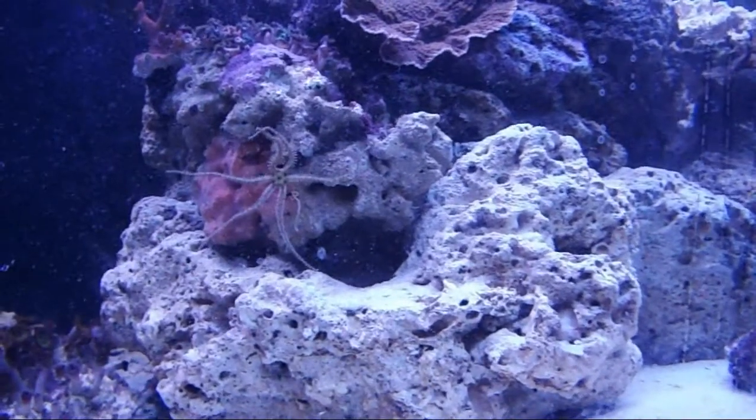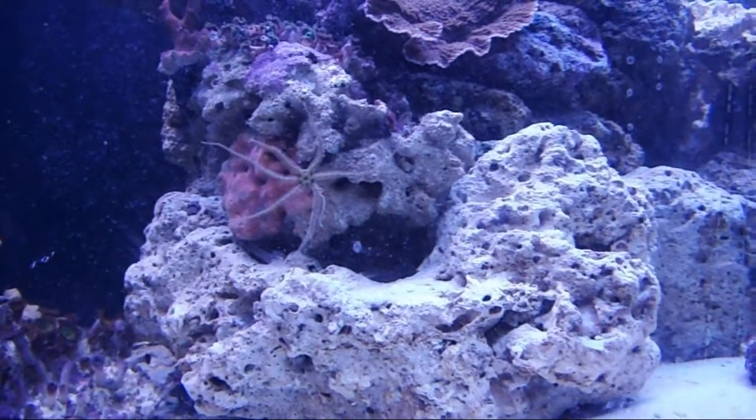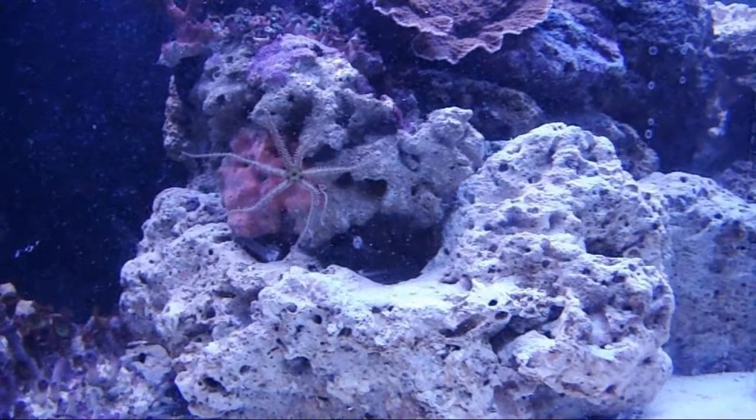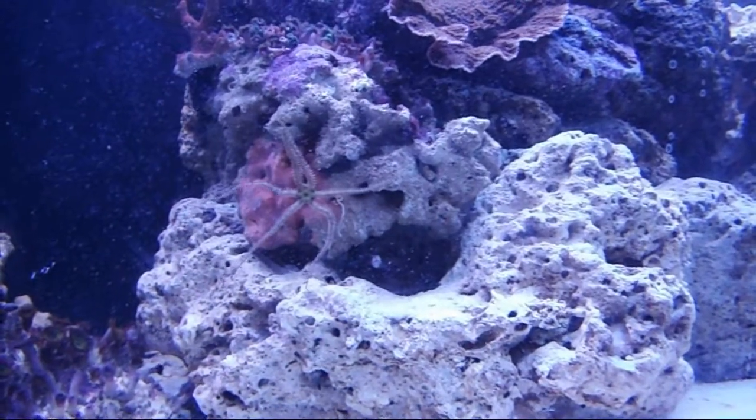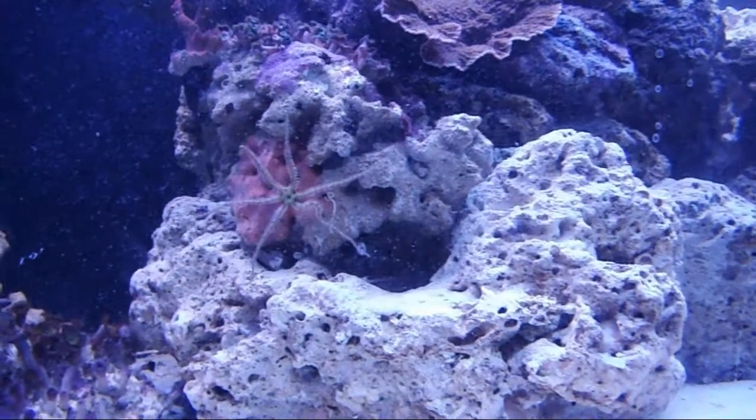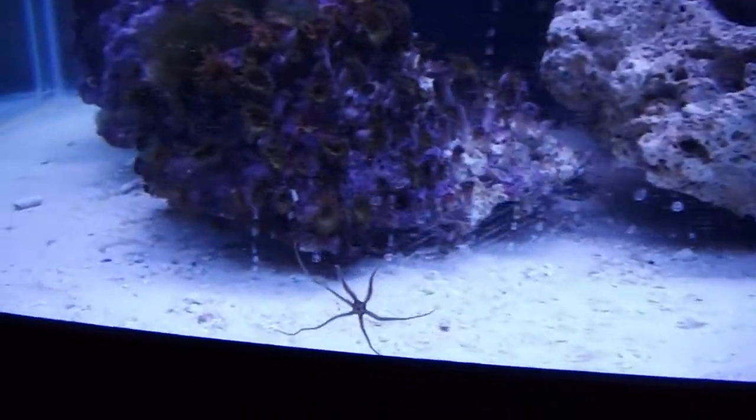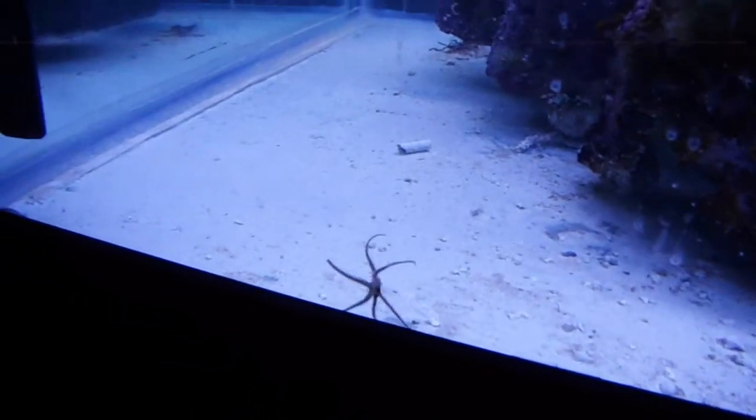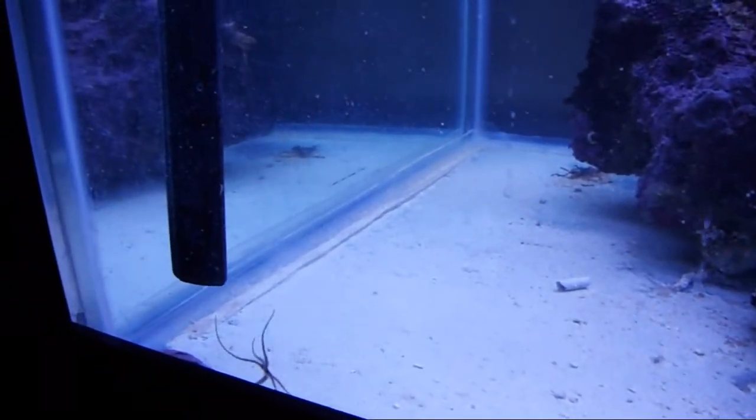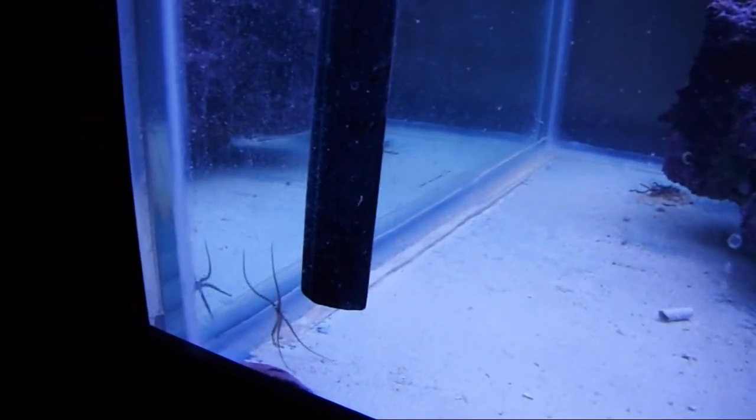This is a fairly good-sized mini brittle star, and it's probably about as big as they get. You can see in the way they look, the way they're shaped, which we call morphology, they are just the same as the larger brittles.